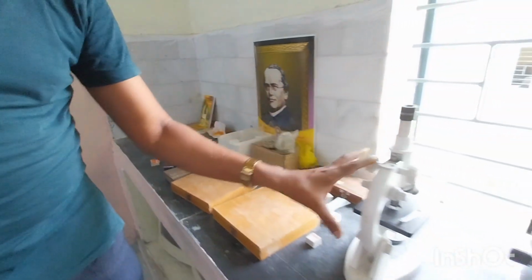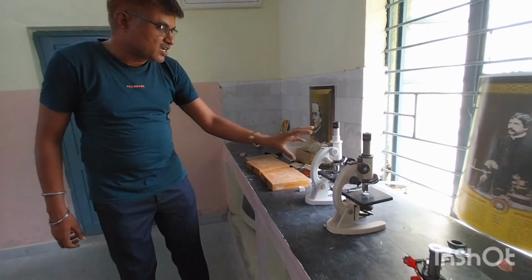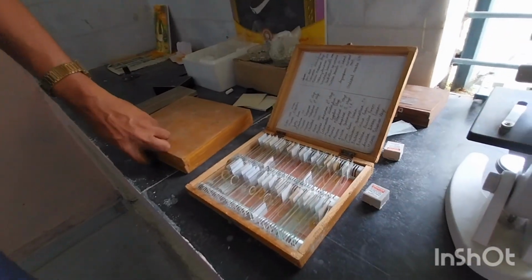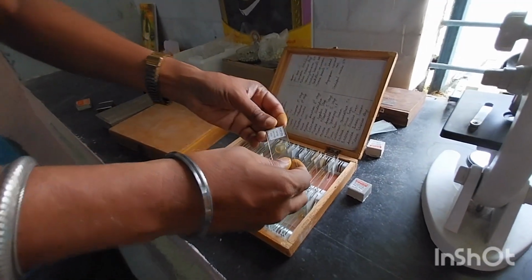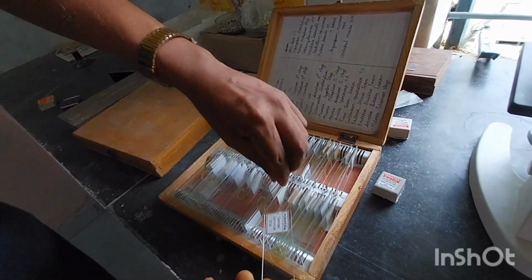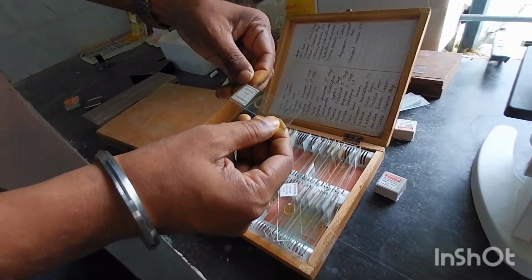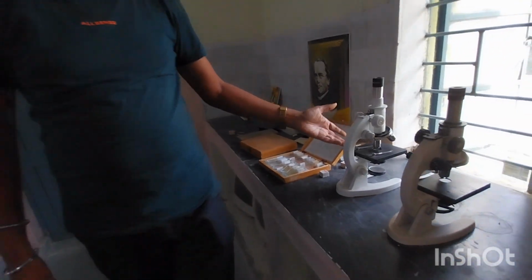And here you are getting the compound microscope. These are the compound microscopes, and this is helpful to see the different types of slides. We have a large collection of slides. Different slides we have, just like here this sponge, and different slides. This is a bacterial slide. Again, we can see the monocot root slide. Different types of slides we can see under this microscope.